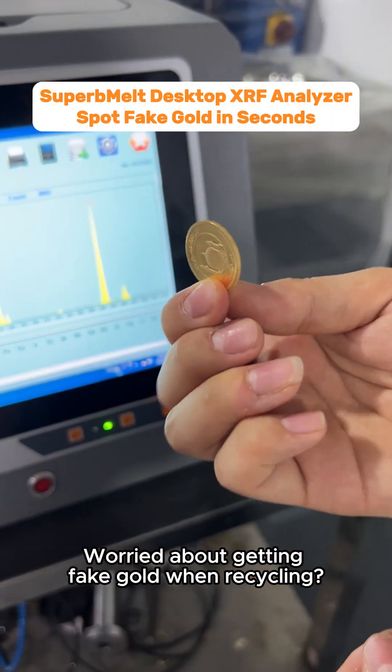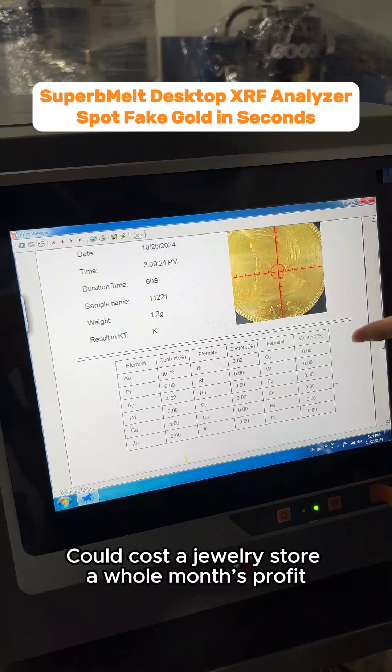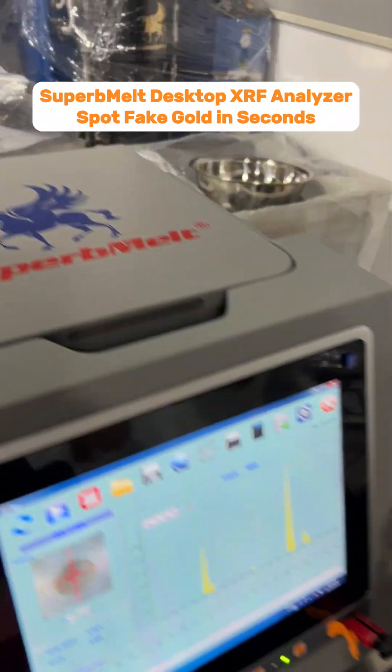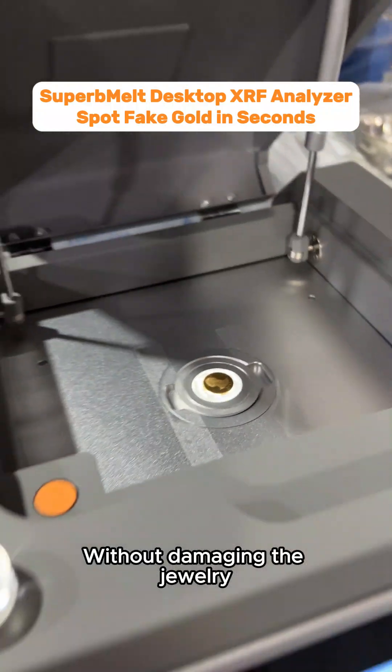Worried about getting fake gold when recycling? A fake or impure piece could cost a jewelry store a whole month's profit. With counterfeit techniques getting better, how do you make sure you're getting the real deal without damaging the jewelry?